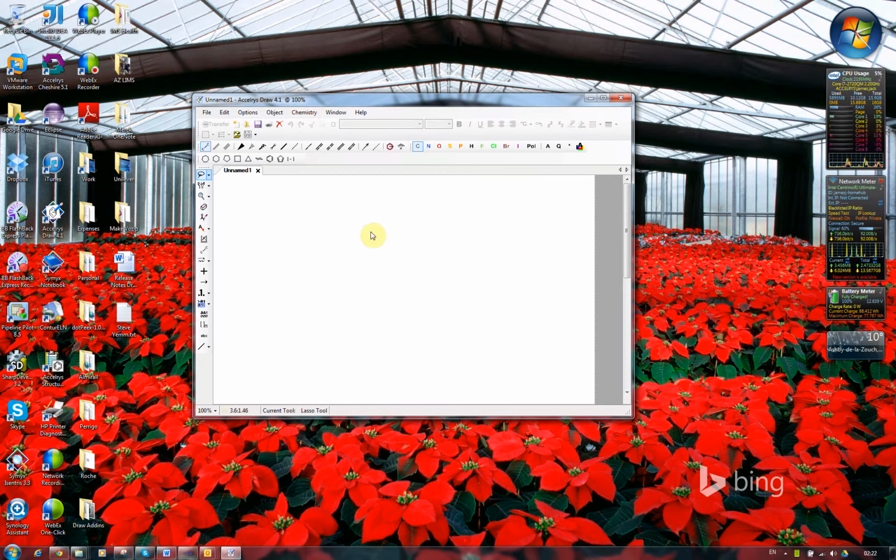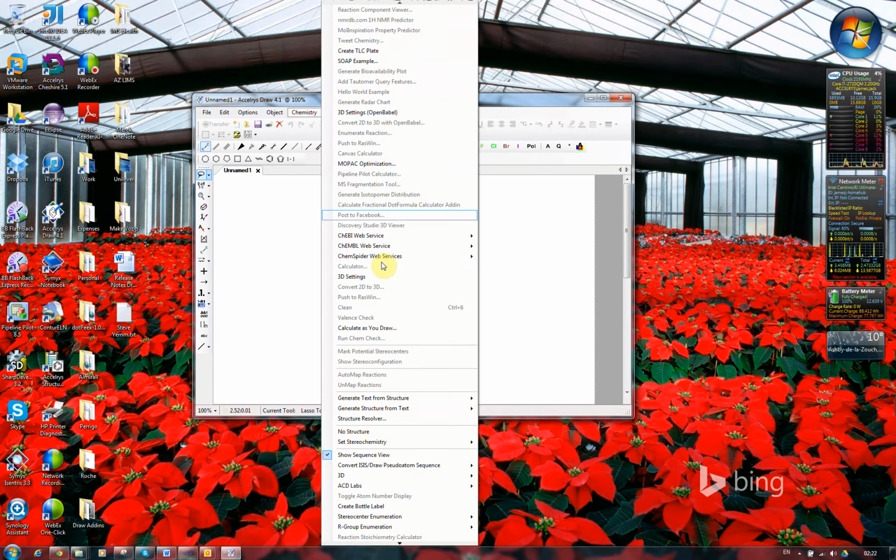In the past, I created a chemistry add-in that connected to the ChemSpider web services. The first one I did was the search and all its methods, and also settings for setting the ChemSpider token. And then a little while later, I added the spectra lookup.